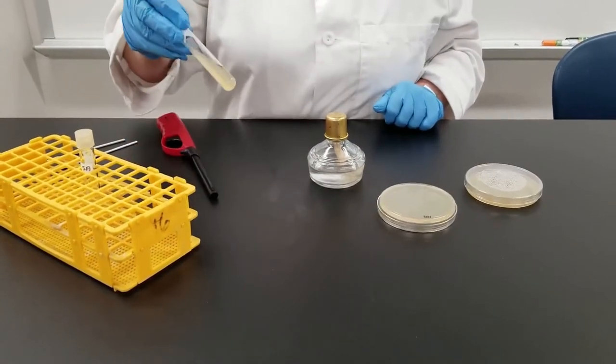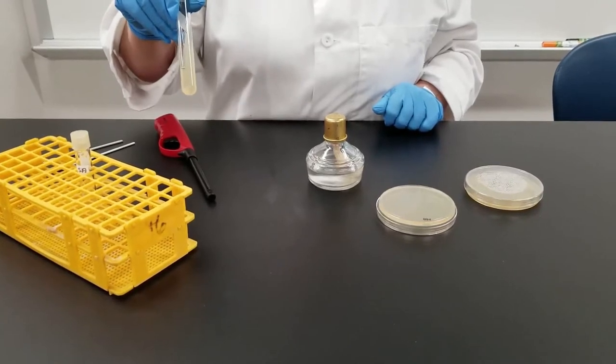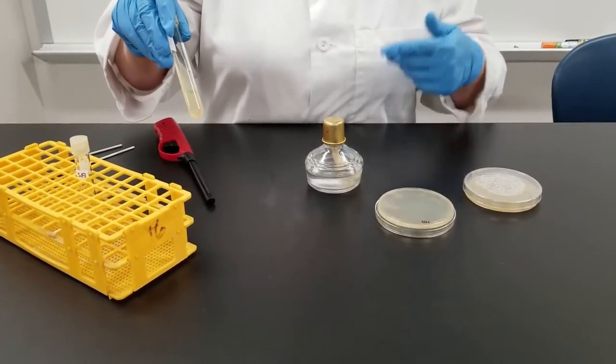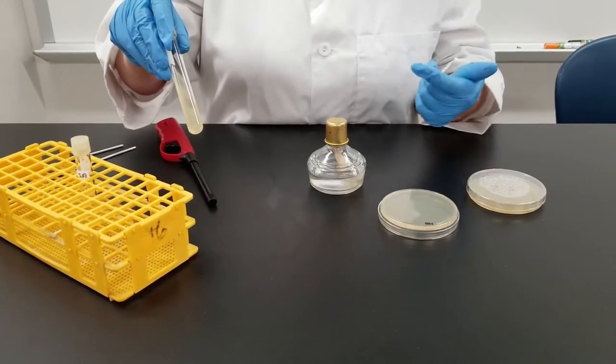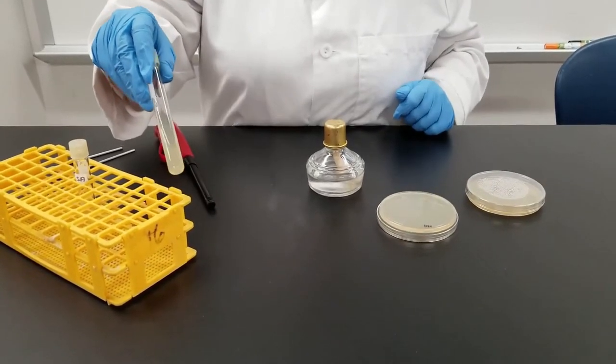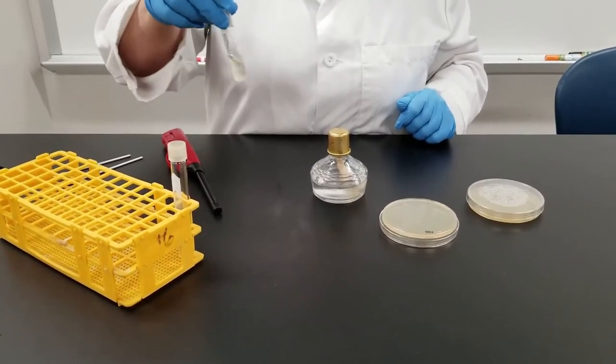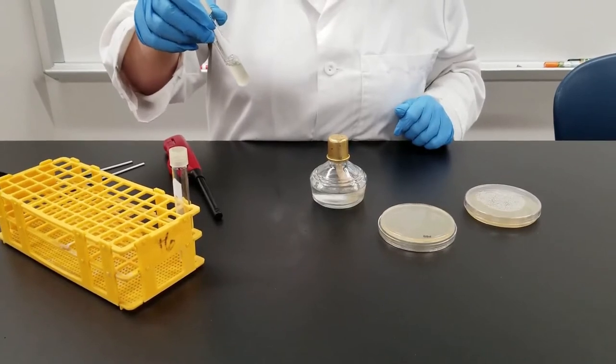Sometimes we will grow them on what we call a slant. That's where you've got the agar. In the agar you can make different types of nutrients added to it. So this would be a slant, you can inoculate that. And sometimes they will be grown in a liquid broth, as you can see in the test tube.